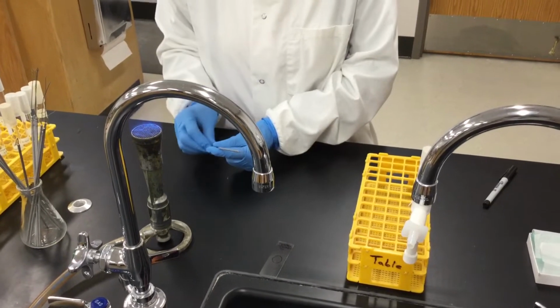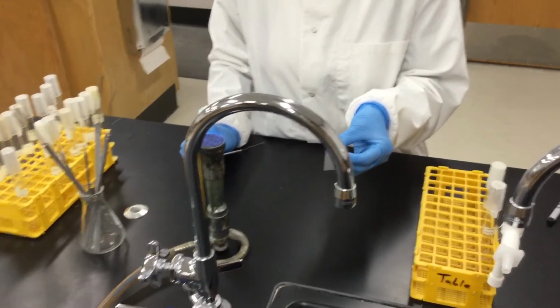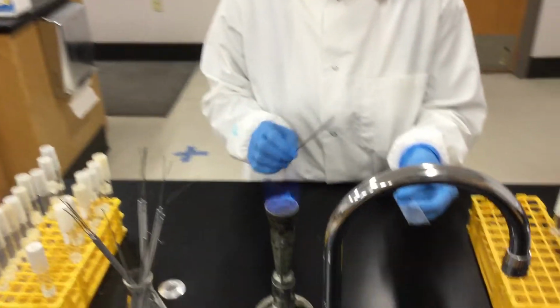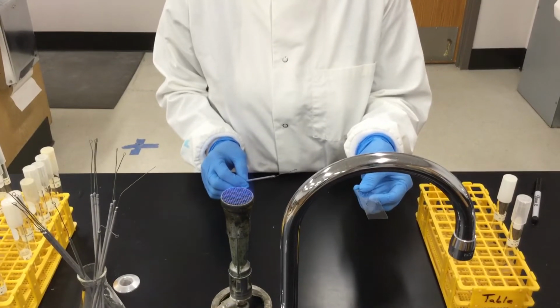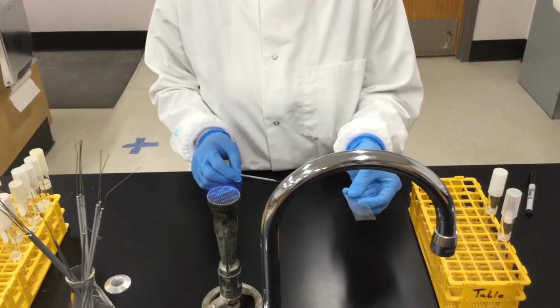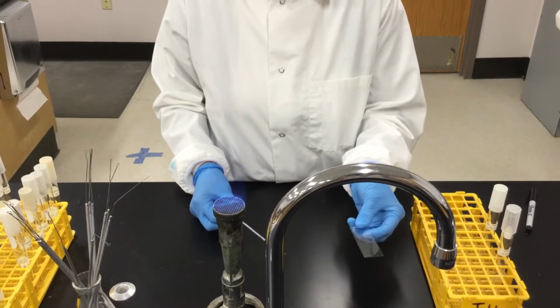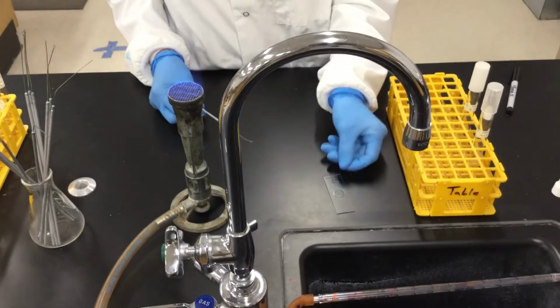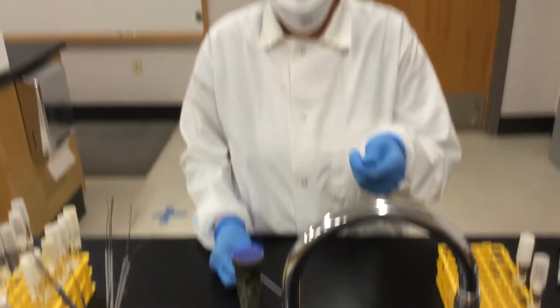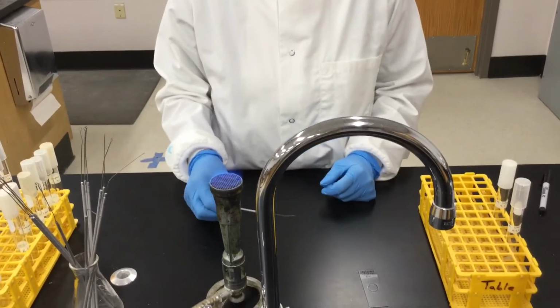While this one is cooling, you will check your slide against the light to see if it's completely dry. So you can see there the area that still is not dry. And then once it's dry, what you're going to do is pass this slide really quickly through the flame two to three times.